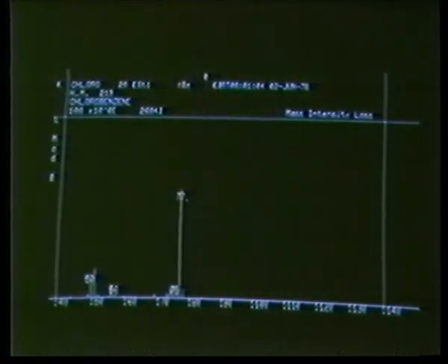The output from the detector is displayed on a screen. You will notice two or three peaks here clearly displayed. These can be enhanced by a computer like this.